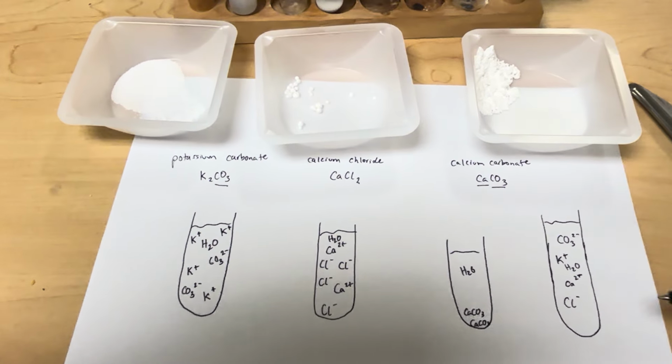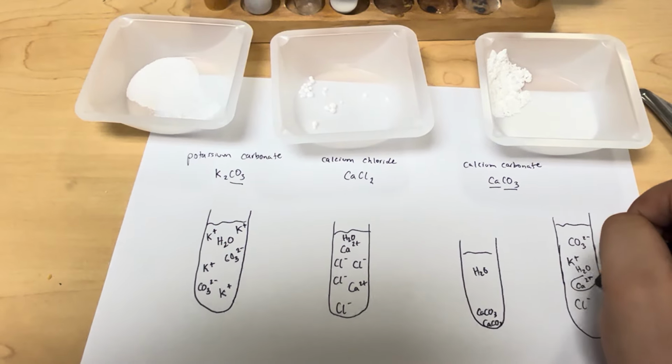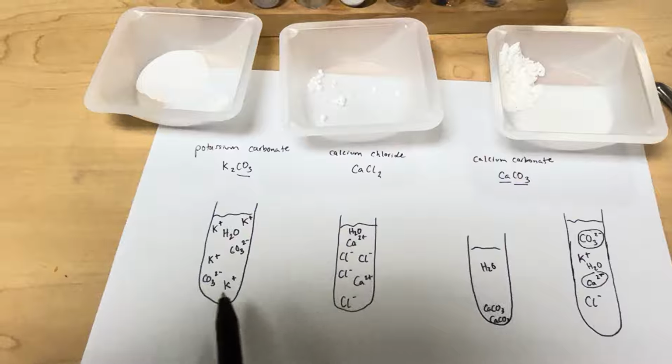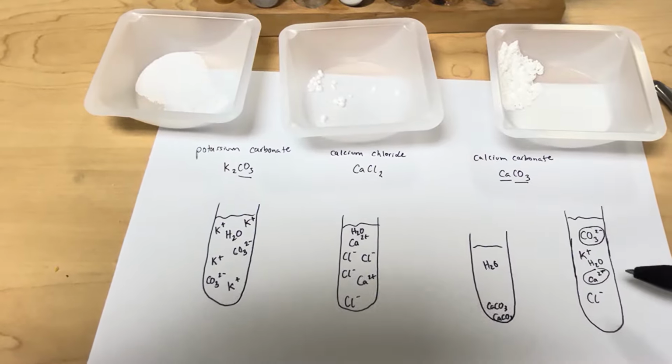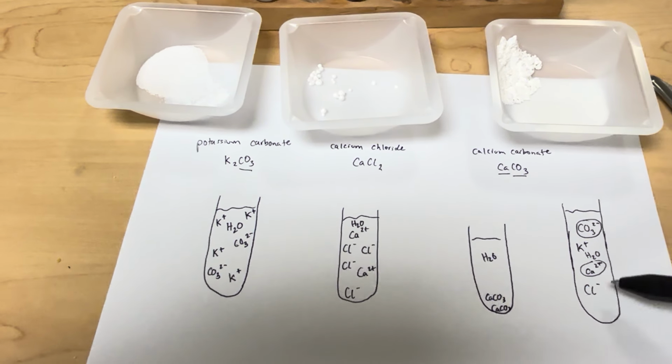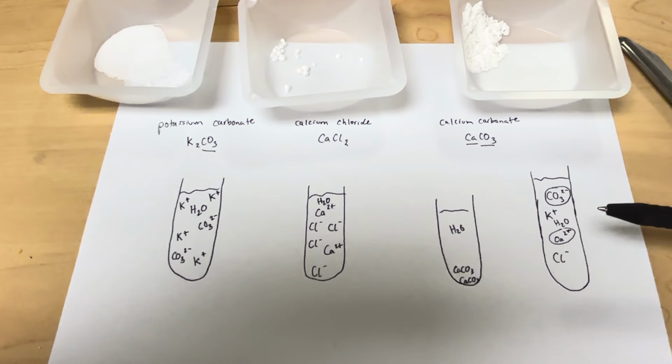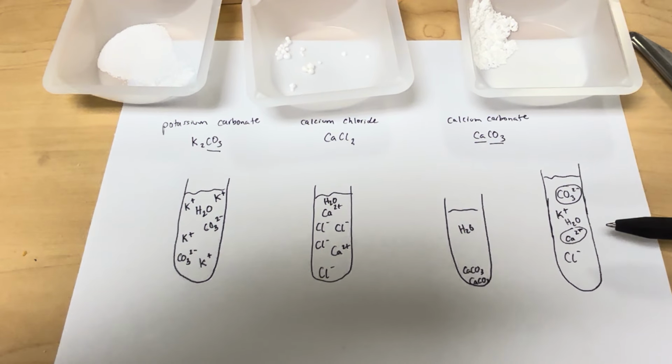They're pretty good at attracting each other, aren't they? And look, when I mixed my 2 solutions, what did I do? I put calciums and carbonates in the same container next to each other. Do you think it is possible that they found each other?